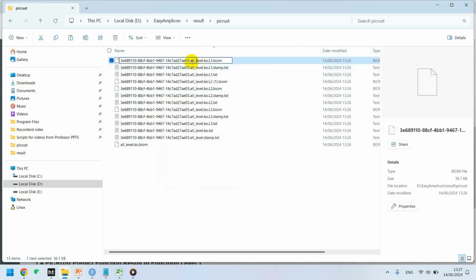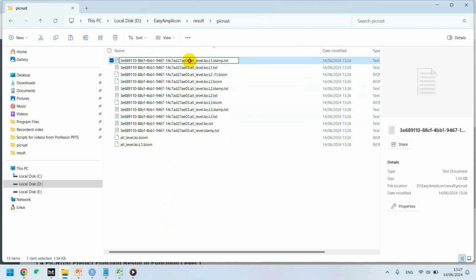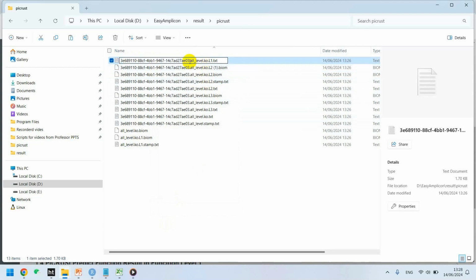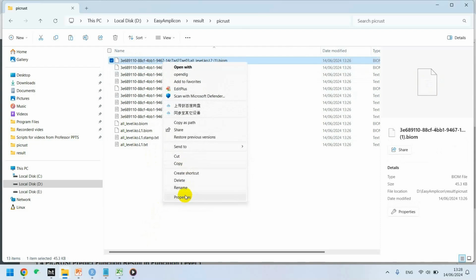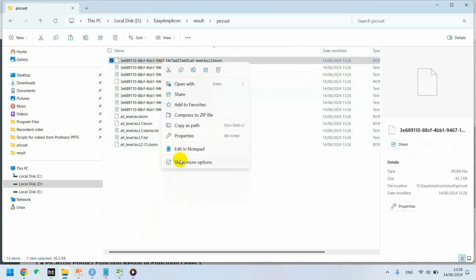It's important to do this here, otherwise you are in trouble when you execute the code in RStudio. So let's get done with this right now. To avoid the error, we have to make sure that everything is done at the right time.